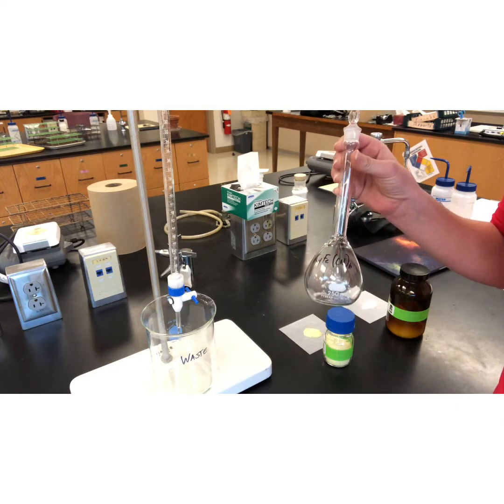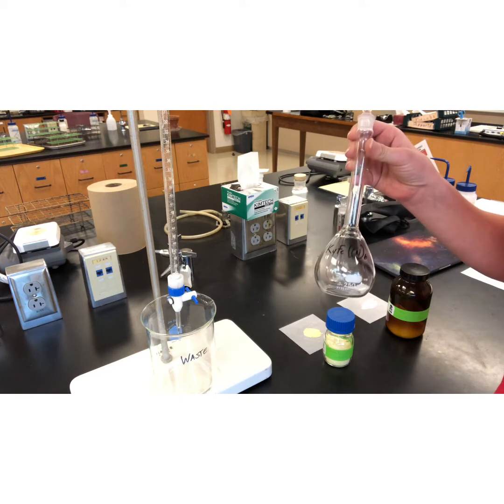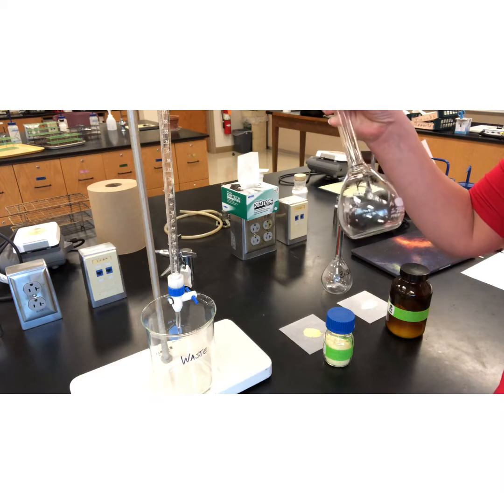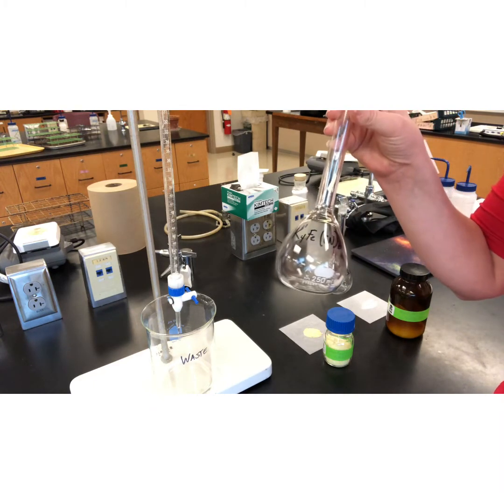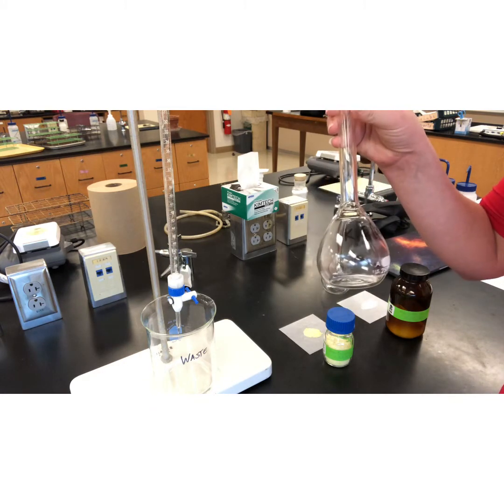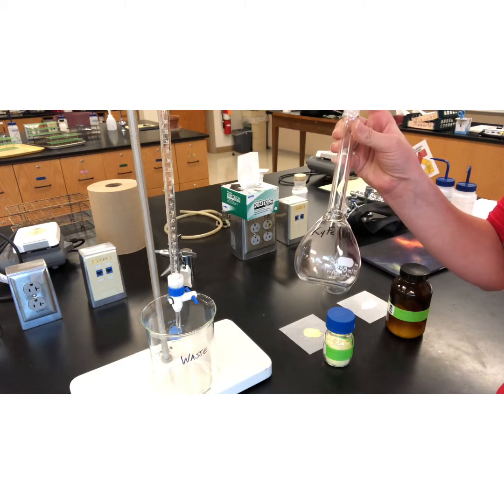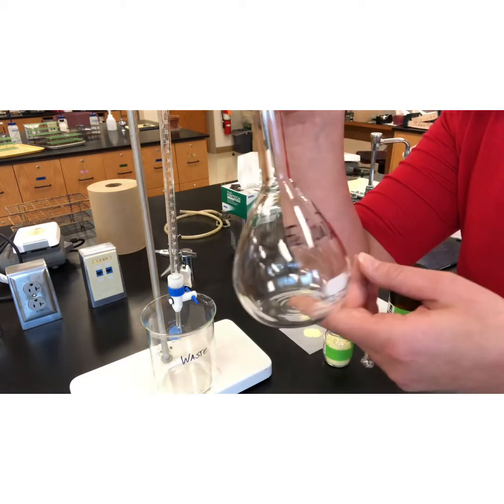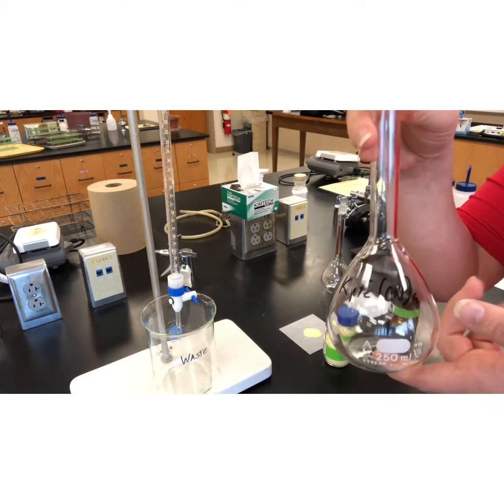Volumetric glassware will measure exactly 250.00 milliliters. There are a couple grades of volumetric glassware, A and B. We have A grade glassware, so we can have two decimal points in our significant figures and calculations. This is going to be the container that I'm going to use for my stock solutions. This first one I've labeled nicely with the K4Fe(CN)6.